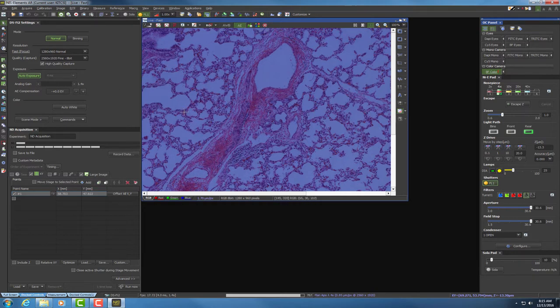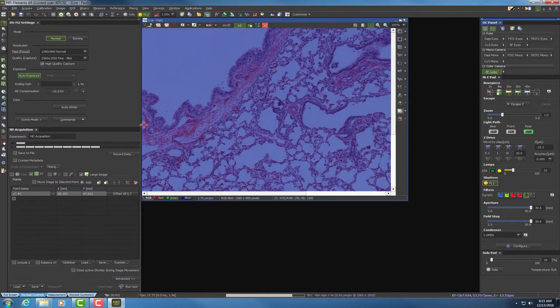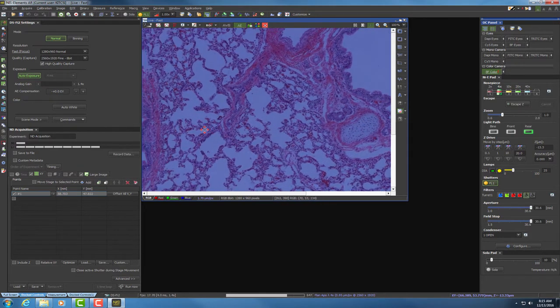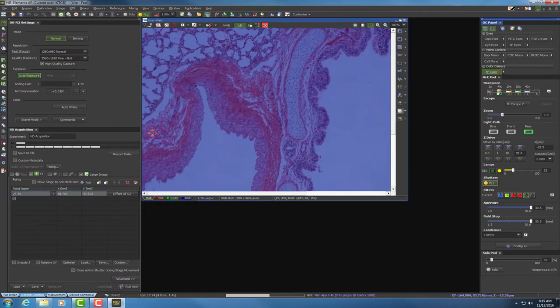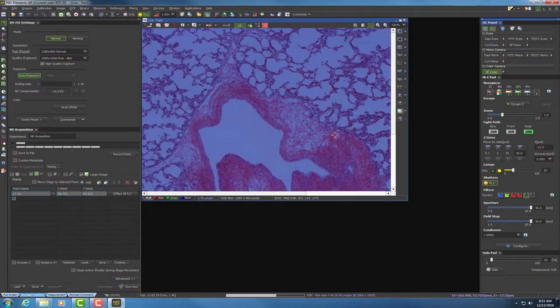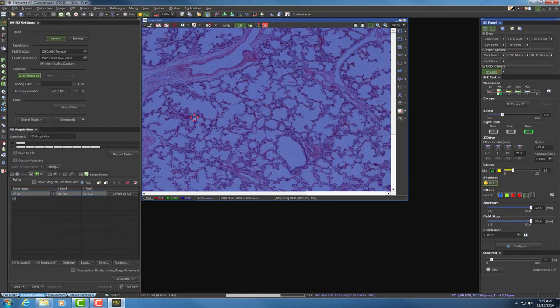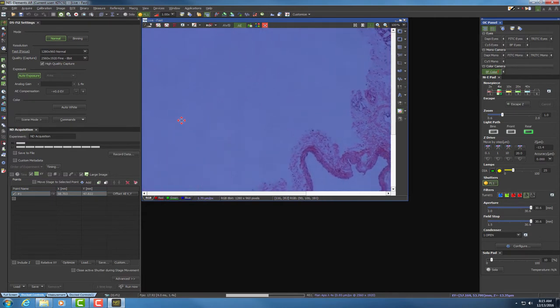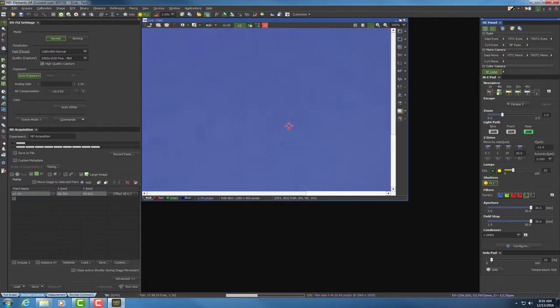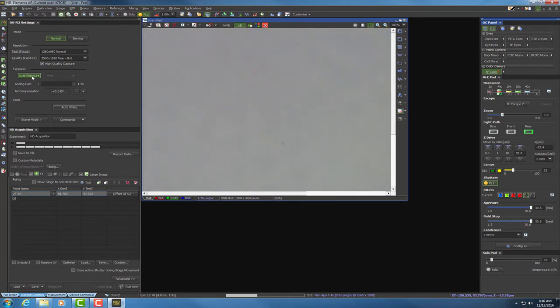Now we're going to move off the tissue and do a white balance. To do that, click on the mouse XY icon, then left-click and move the stage to an area outside of our tissue. This is a fairly large piece of tissue, so once we're outside the tissue area, we're going to select auto white. Then hit auto exposure again just to make sure it's auto-exposing.